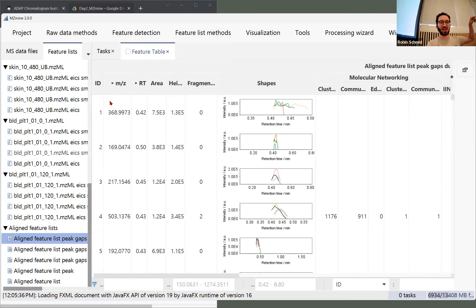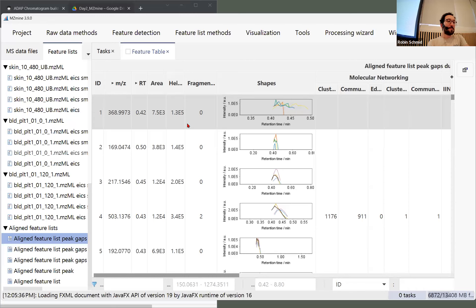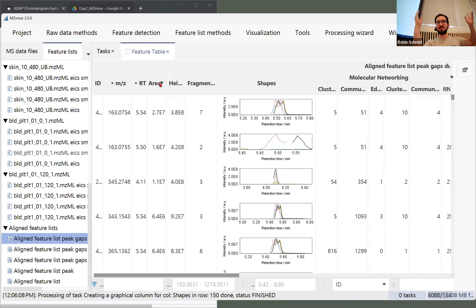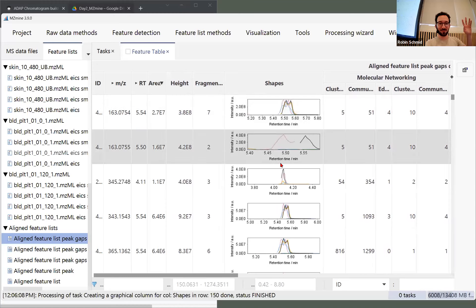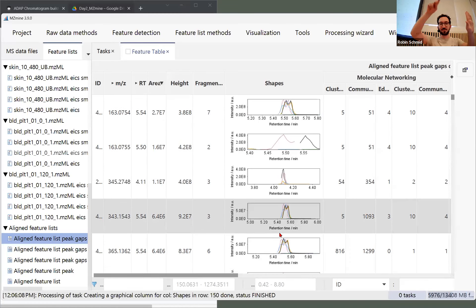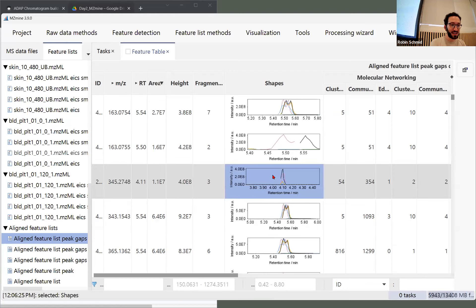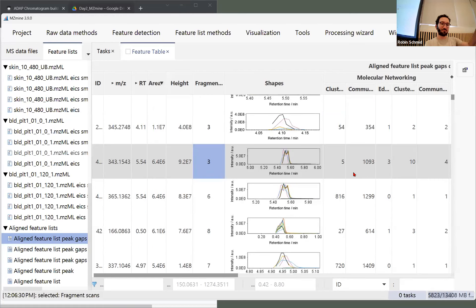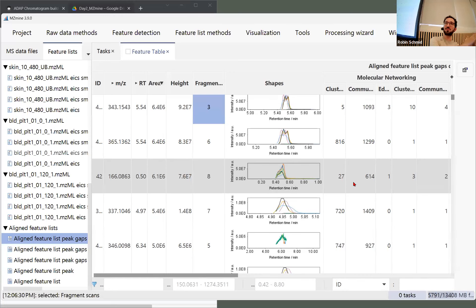You can also check different feature lists in the same view, or just open multiple tabs. Here we see the different shapes — it makes sense to go for the very abundant things, so if we sort by area or height, you can see nice feature shapes, or maybe two isomers slightly separated. Now we have multiple features with different colors — different samples detected in different samples. We can also look at retention time differences the way Stefan showed, and look at the shapes.